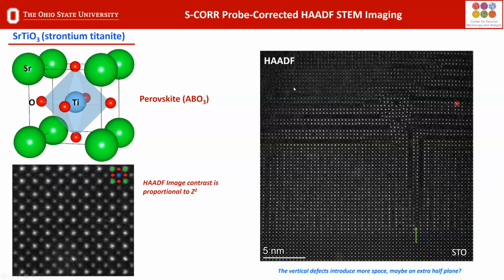As we look up here, we see a very different looking structure in the top of the image than we do in the bottom. So what's going on there? What are these dark lines? If you've ever worked in metallurgy or dislocations, these look very interesting in this central region. If we think that they might be edge dislocations, we can zoom in and look more closely at what's going on.